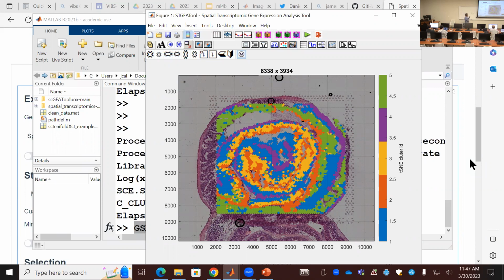Yeah, as I said, there are a lot of functions which are more complicated ones under development. Some functions, like we will detect the boundary spots and look at their interaction. Their interaction, if they are based on physical contact, suppose those kinds of interaction will be stronger compared to the spots which are not physically in contact.